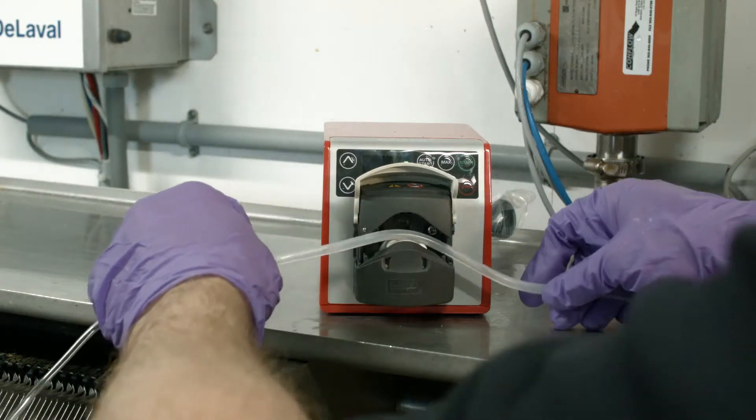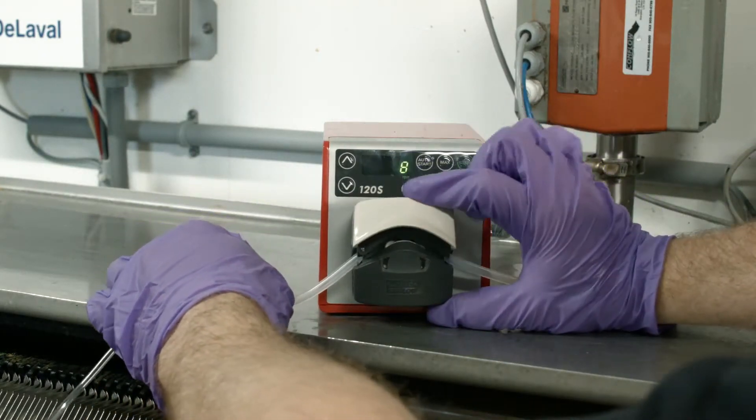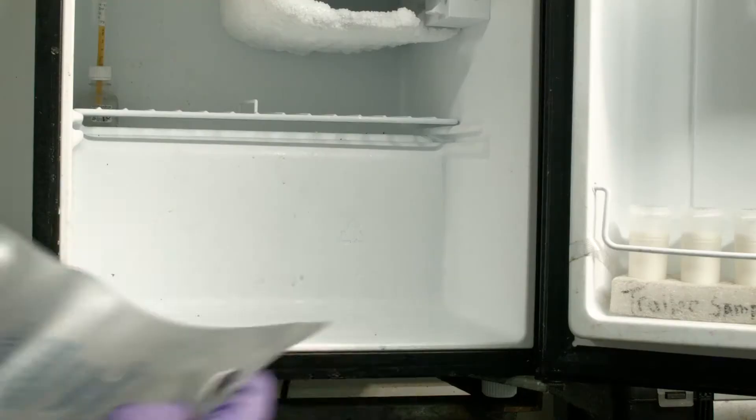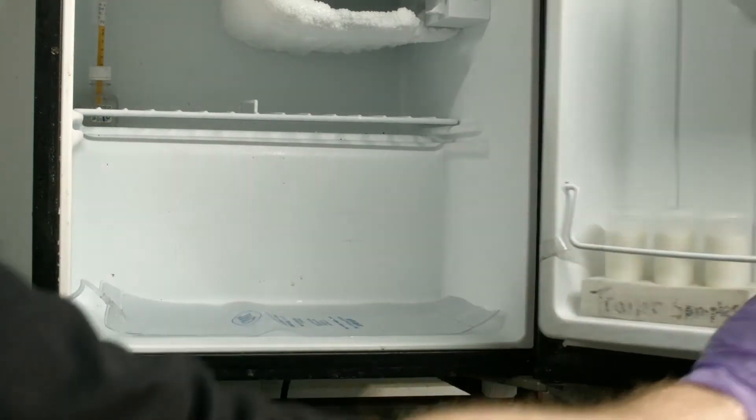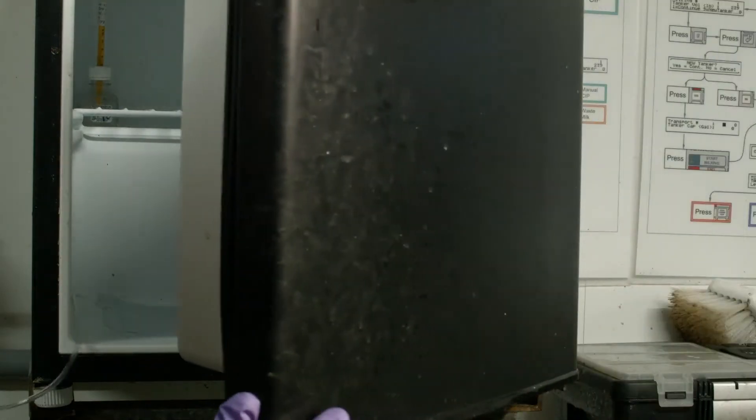Place the soft portion of the tube attached to the collection bag into the peristaltic pump and place the bag in the cooler or refrigerator that is set between 0 and 4.4 degrees Celsius as required by PMO regulations.